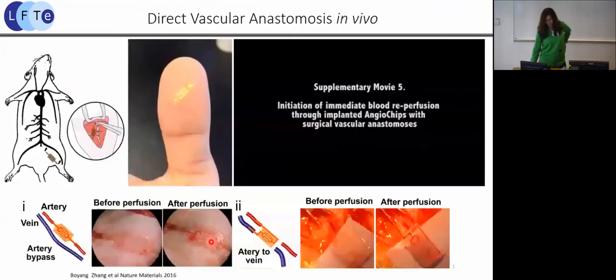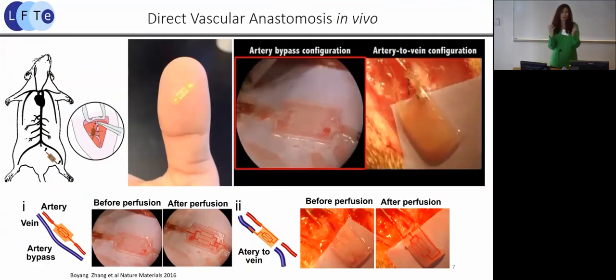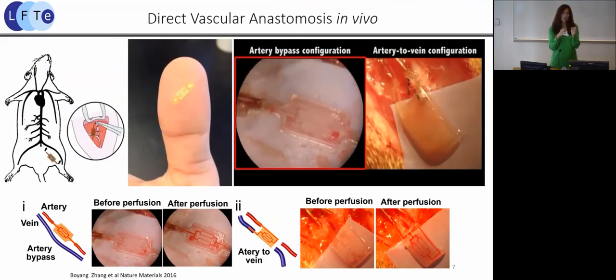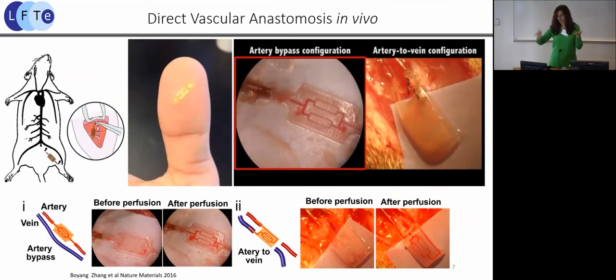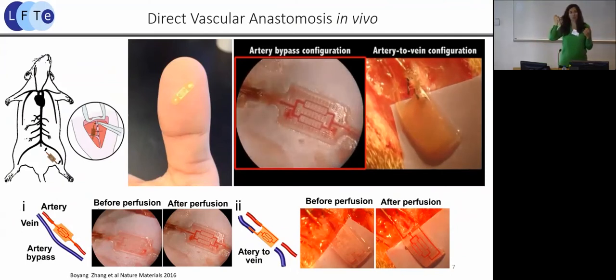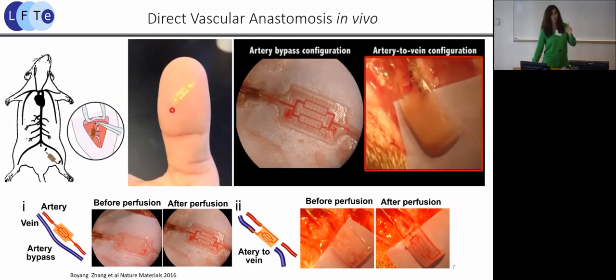But what I think is really nice with this approach where you're working with polymers, and that's why I titled this talk Microfabrication of Elastomeric Polymers, is now you don't have the case where the cells are squeezed between PDMS and glass slide. And you can just take this tissue out of this fabrication plate that we use for cultivation, and the tissue is actually quite small. You can see it here. It's quite small, but it still uses 2 million cells, which is a lot of cells.